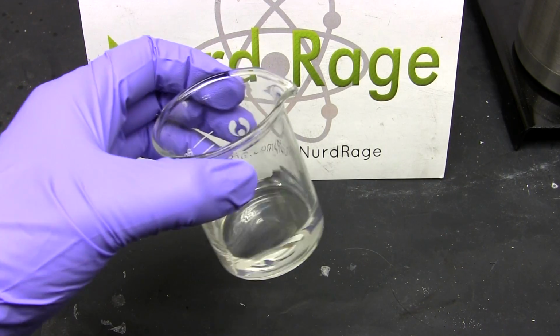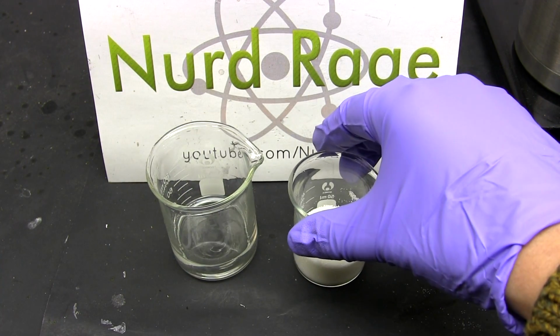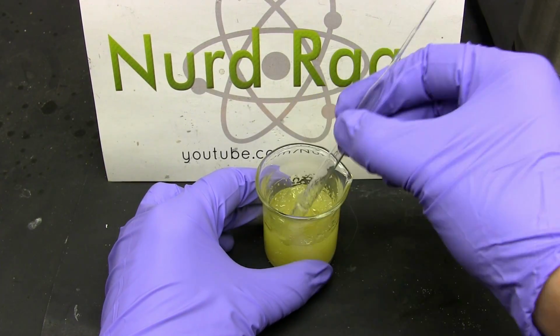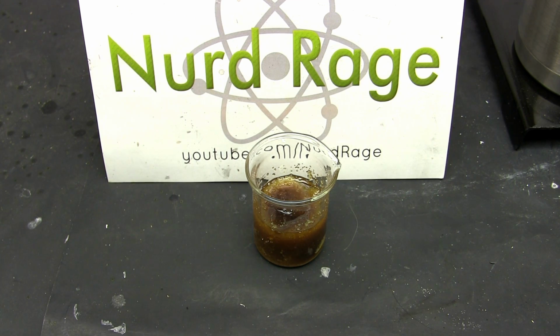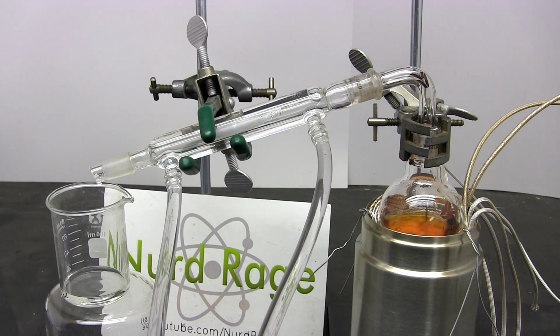Anyway, if you want to test your 98% pure sulfuric acid, a fun thing I like to do is the classic sugar-carbon pillar experiment. Just mix the acid with an equal amount of sugar and wait. Concentrated acid will dehydrate the sugar and convert it to carbon that should form a pillar that rises out of the beaker. Anyway, that's how you purify sulfuric acid by distillation.